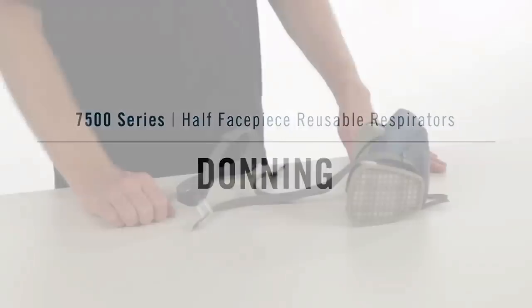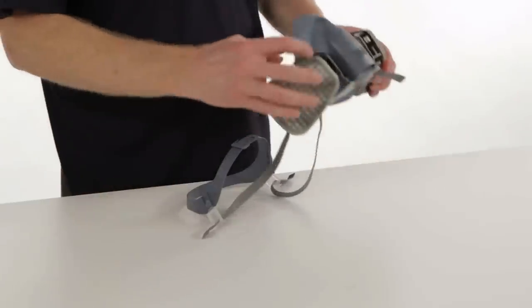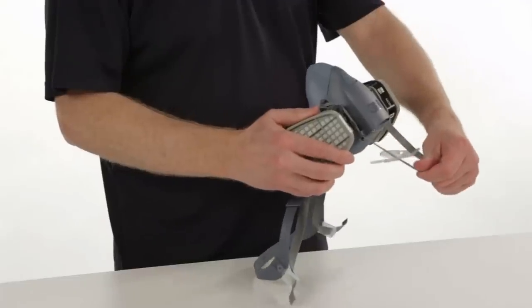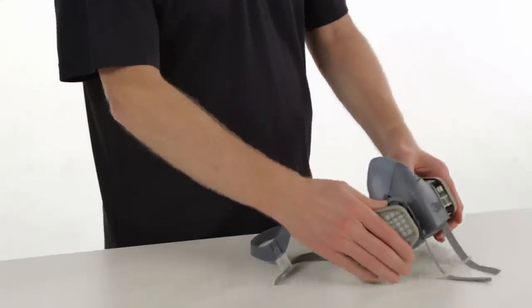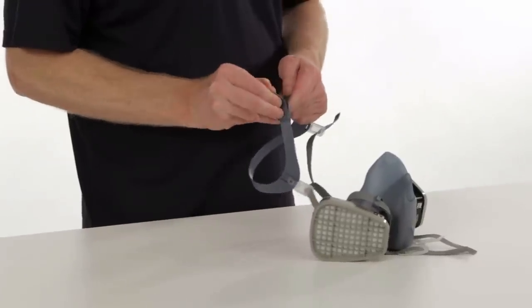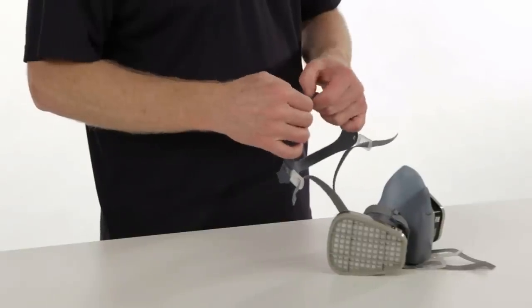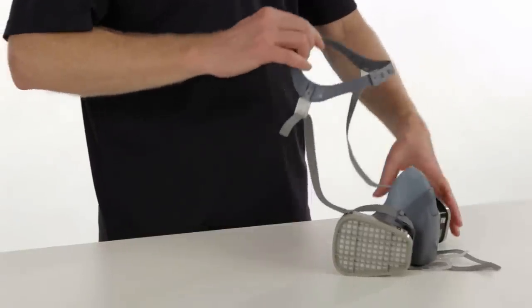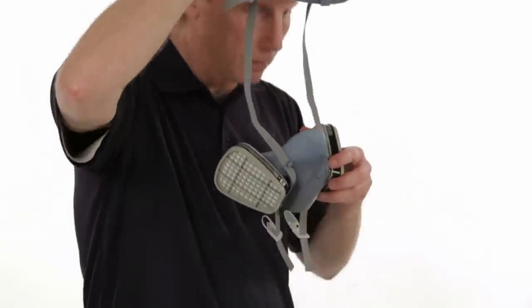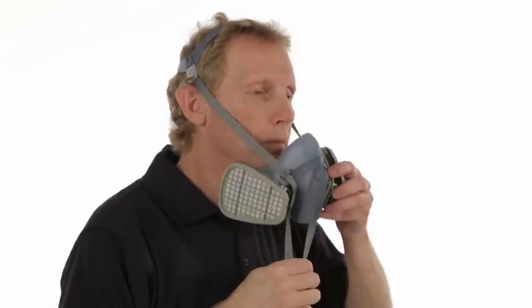Now let's cover donning in the drop-down suspension mode. Before you put on your respirator, make sure the straps are over the locking tabs, untwisted, and pulled far enough through the buckles to permit easy grasping. Adjust the head cradle size as needed to fit comfortably over your head, and place the cradle on your head.